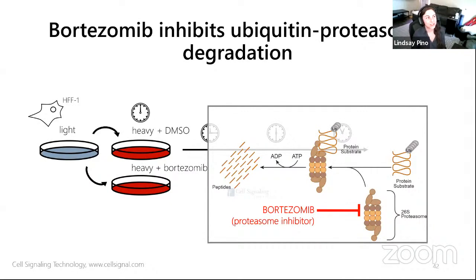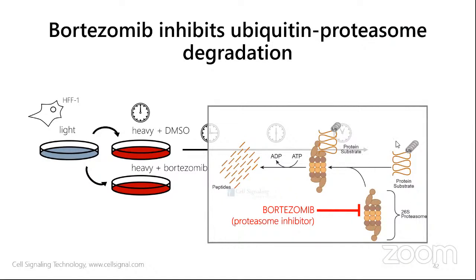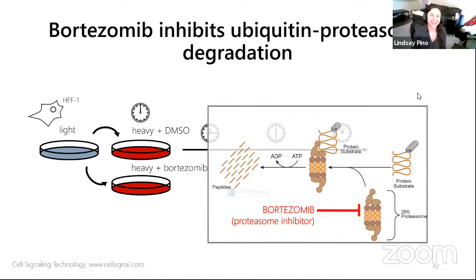One of the take-home messages I got from that paper comparing DIA with TMT is that they are about the same in terms of accuracy and precision. It's just whichever one you're more comfortable doing. For example, if I tried to compare DIA and TMT, TMT would probably look awful just because I've never done it before, but I've done DIA a lot. I'm sure there are other labs very comfortable doing TMT, where their DIA might not look as good as their TMT. That's pretty much the general conclusion. Perfect. Glad my too long didn't read version of the paper hits the right take-home message.